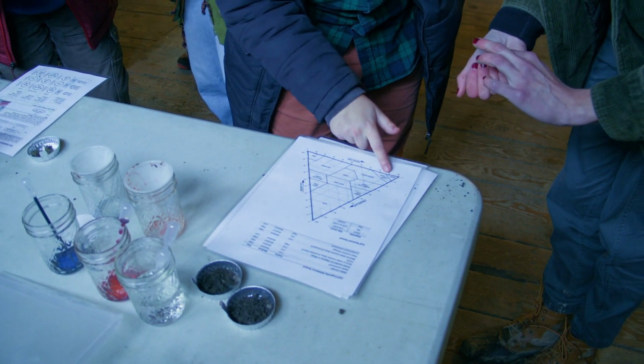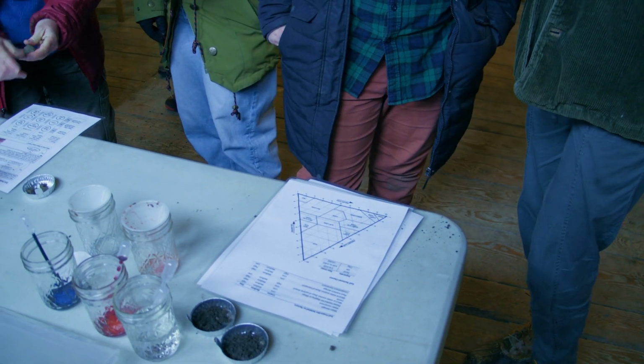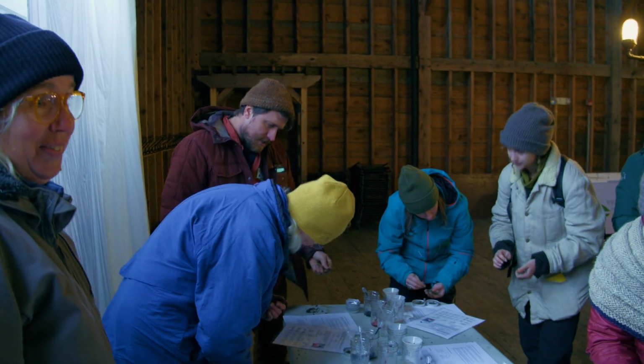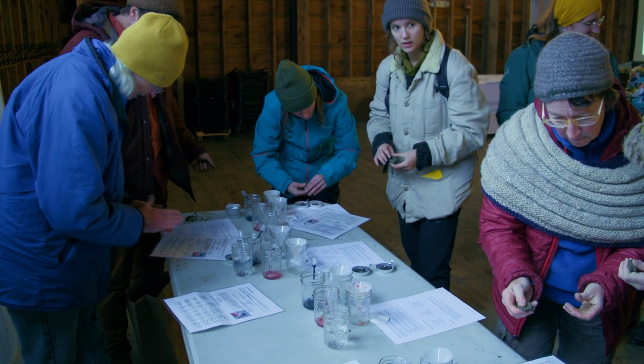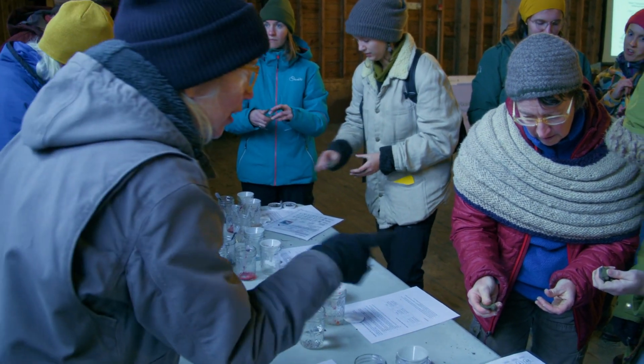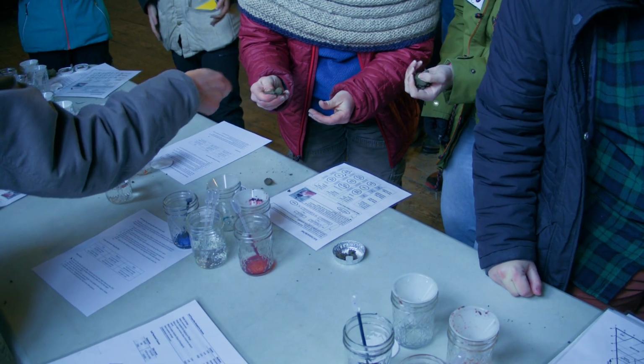It's like 90% sand. 100% sand. Cool. Same thing if you were on the roadside. Gently pushing it. Yeah, you guys are doing it right. Sort of squeeze it out of your hand like this, like you're doing, and then now you've got a little piece.